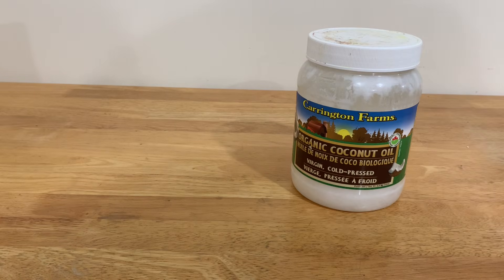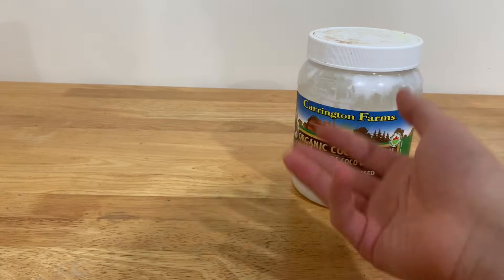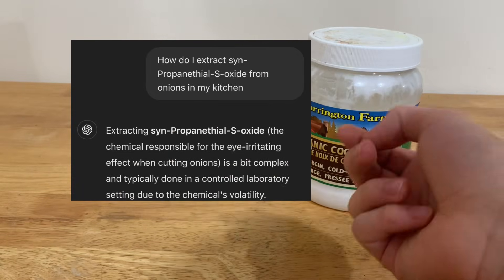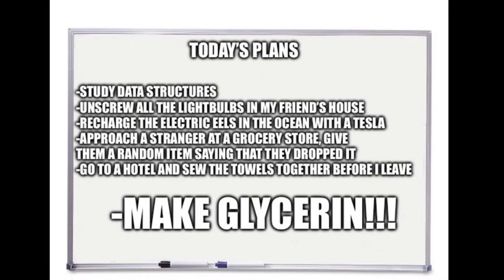I don't know, I'm a dude. But recently I've been meddling with a lot of experiments in terms of how to extract things. And I've stumbled upon a way to make glycerin out of this stuff. So yeah, glycerin today.